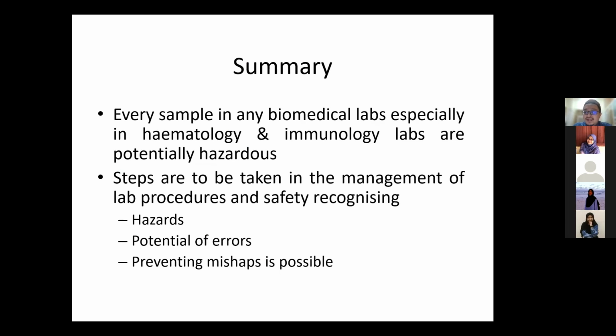Okay, this is the last slide. I'm sure you are all dying to go now because today's lecture is somewhat dry. Something that you have heard before perhaps. Every sample in any biomed labs, especially in hemato and immuno labs, is potentially hazardous. In fact, we treat all samples as hazardous. It doesn't matter whether we know it is HIV or not, we treat all samples as hazardous.